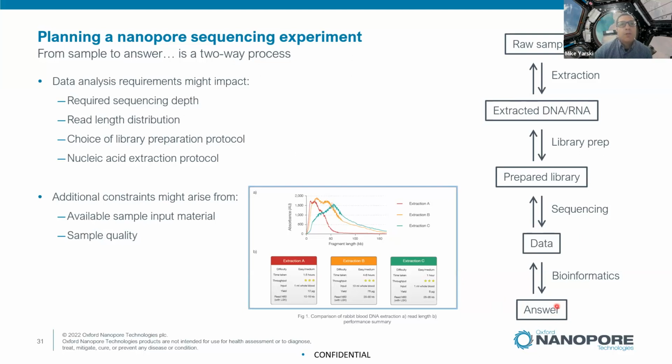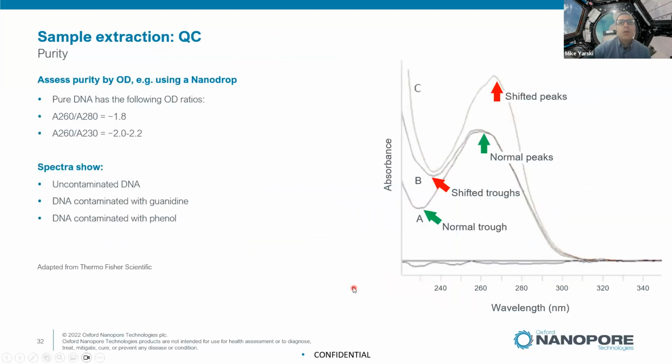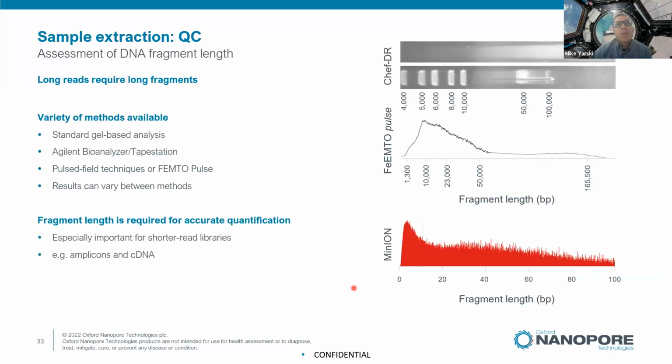And of course, Nikki alluded to that the quality of DNA is really important for nanopore sequencing. So of course you want to make sure your A260/280s are 1.8 and your 260/230s are 2. And there's quite a bit of information on DNA handling and QC metrics. The main thing, if you can do it, is size your DNA sample before you do a library prep.